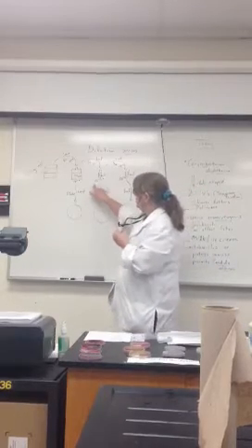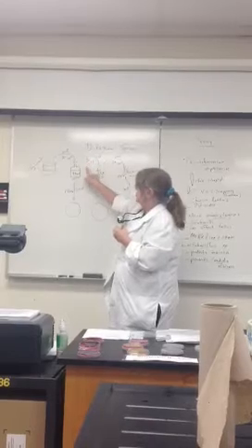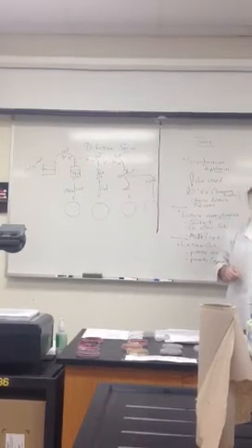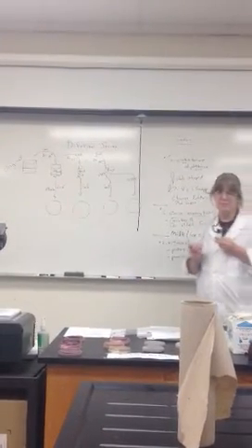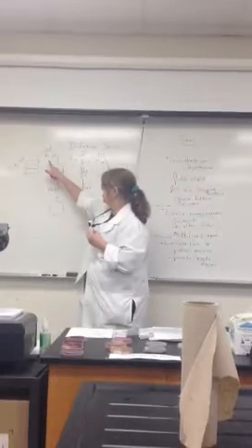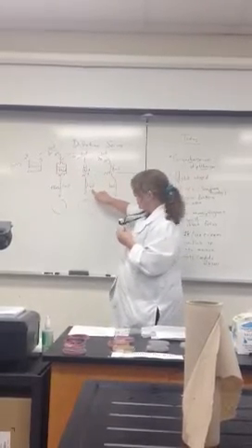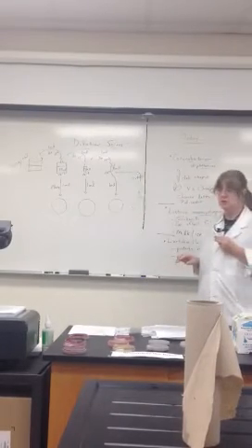But here, you have a 1 to 100, a 1 to 10. You're going to have to realize that 1 over 100 times 1 over 10, it's going to be 1 over 1,000, which is 10 to the minus 3. See how you add the zeros or multiply actually? This becomes a 10 to the minus 3. You plate 1 mil, still 10 to the minus 3 on that plate.